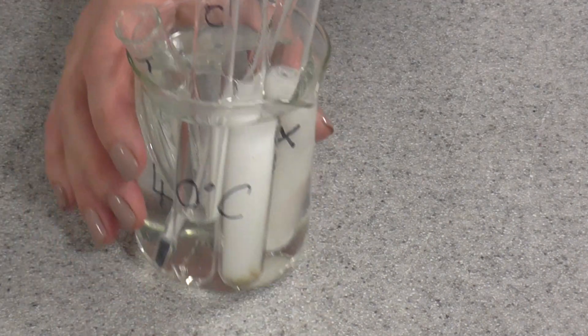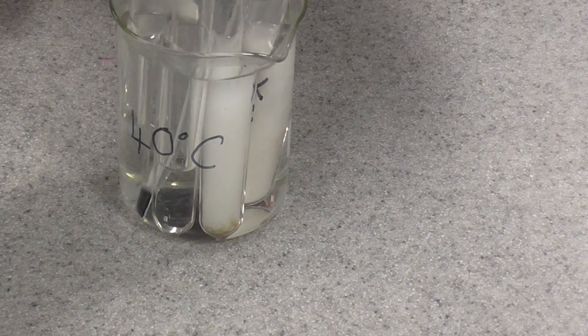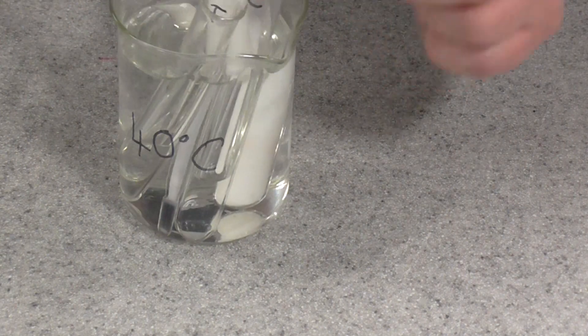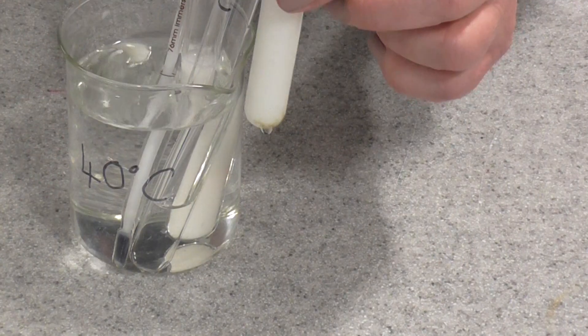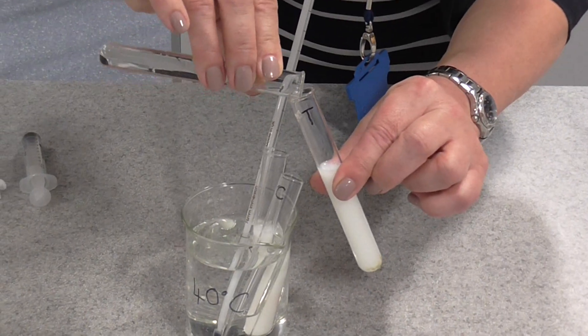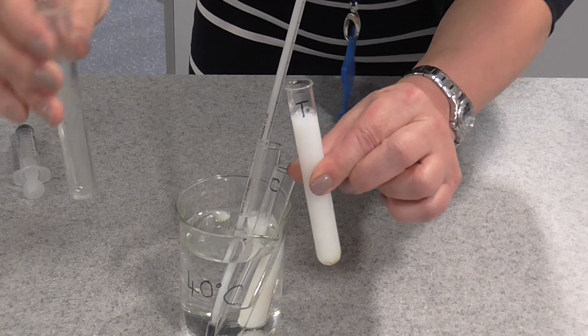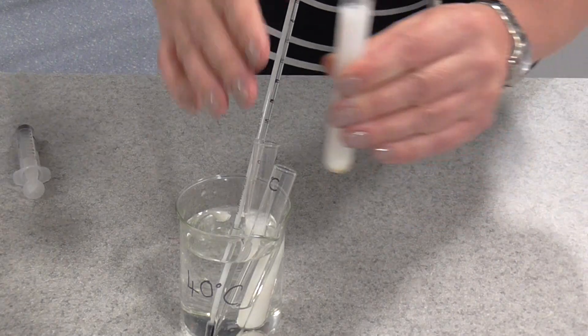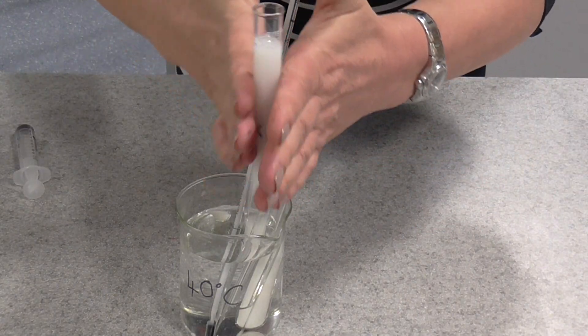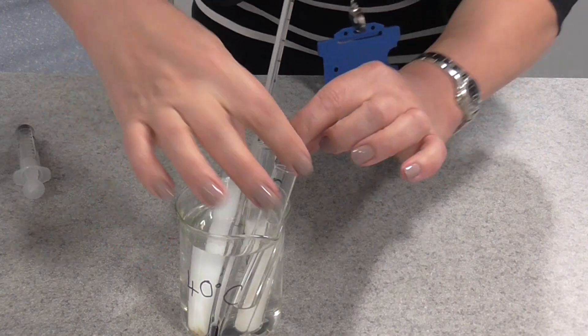The next thing we're going to do then, into our tube of milk labelled T, we're actually going to add the trypsin enzyme. We can get rid of that tube now. We're going to give it a little mix, and then we're going to place it back in the water bath.